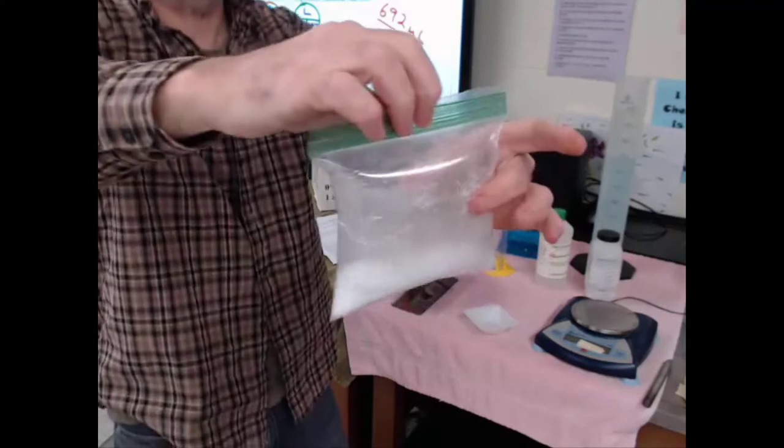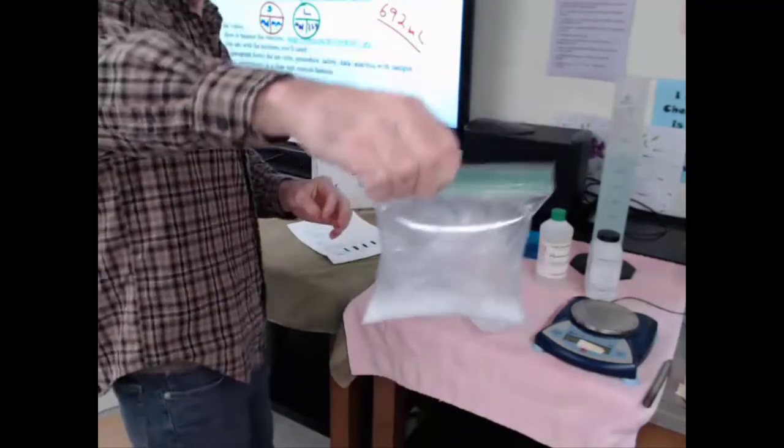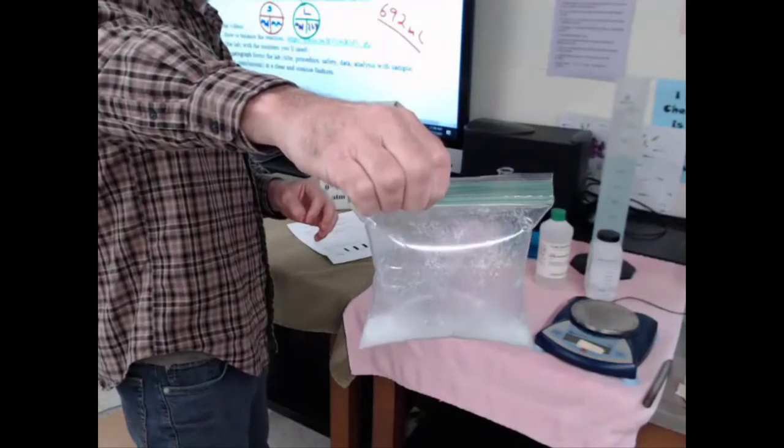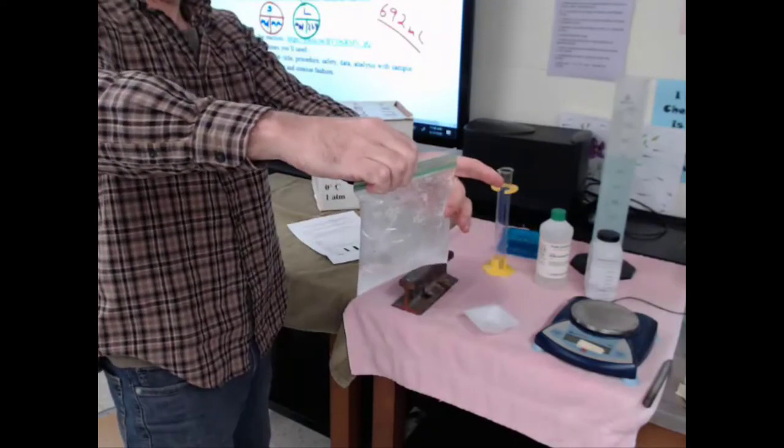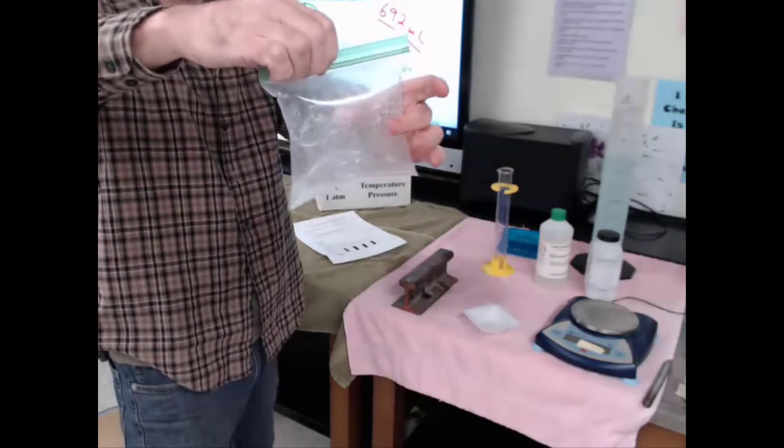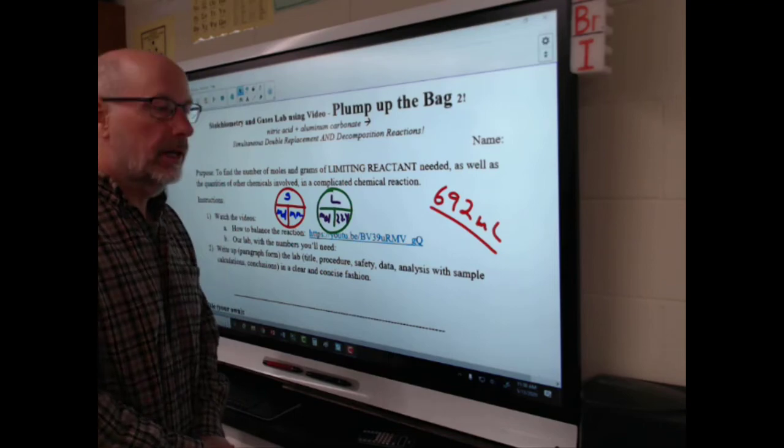The bag is just about full! I hope it doesn't go any farther. It's really full and very turgid. That's perfect - filled it up just right. So your job is to tell me what happened in this lab.